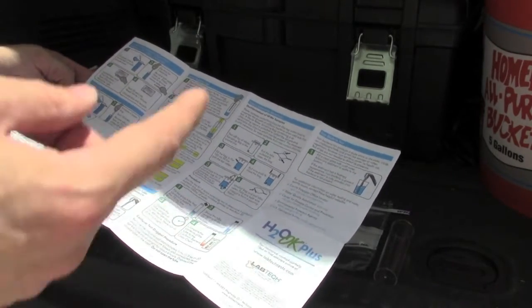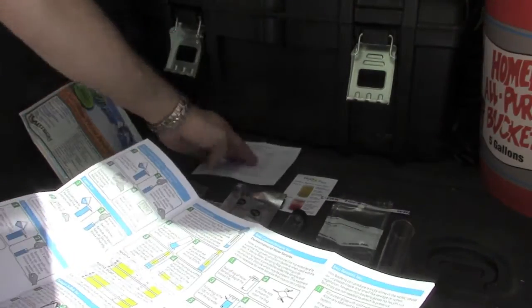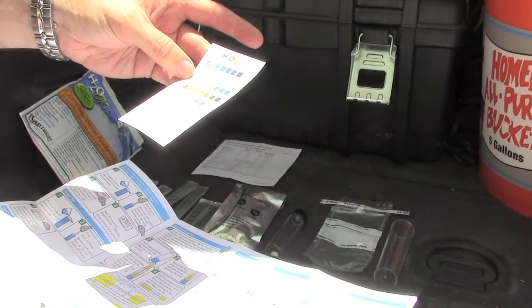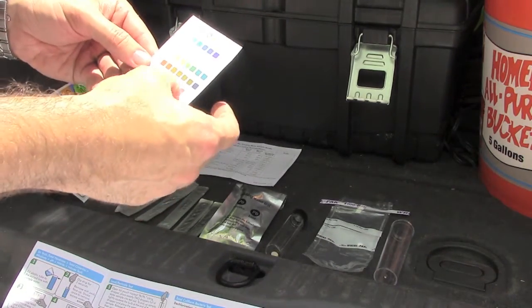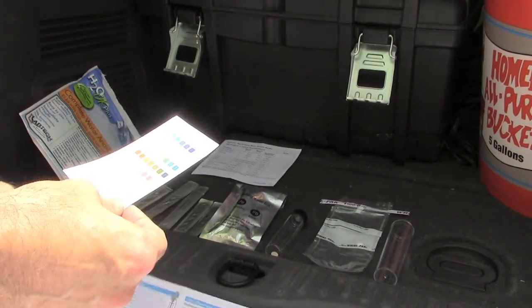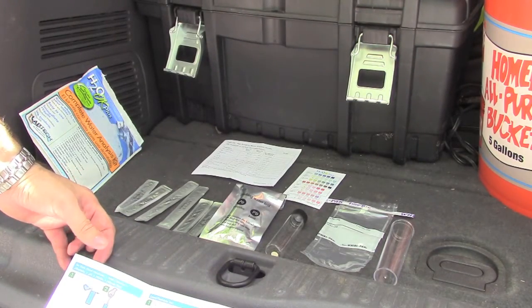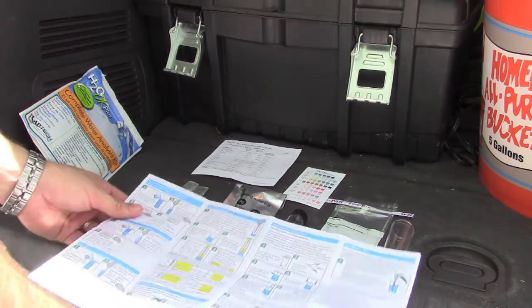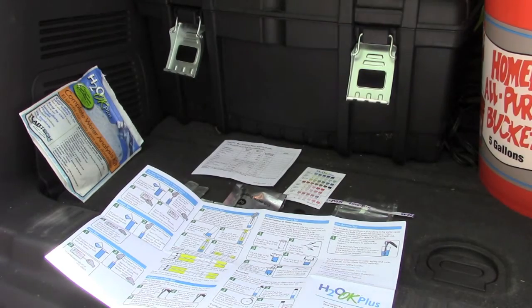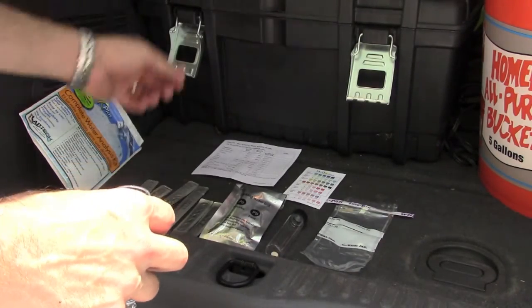We've got some water from the well and we're going to give it a shot. The well is not connected to the house, but we're going to test it anyway. On the back of the coliform instructions it also covers copper, iron, nitrates, pH, alkalinity, chlorine, and hardness. I heard a little thunder — I need to get a plant planted but let's go for it.